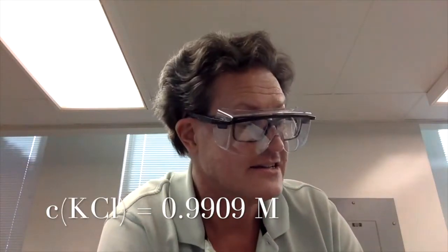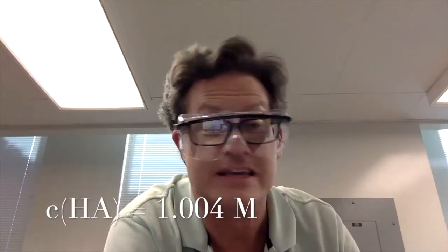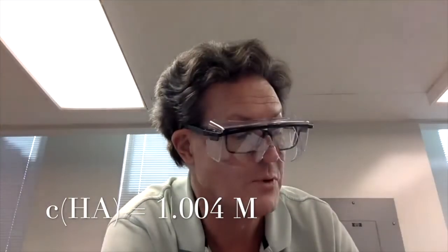We're going to note that the stock concentration of the KCl is 0.9909 molar. And the stock concentration of the acetic acid is 1.004 molar.